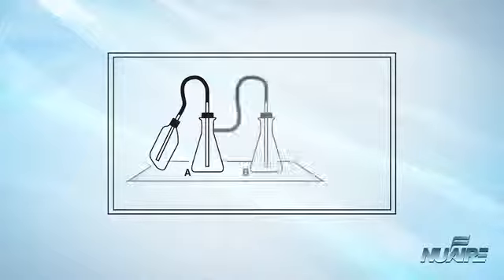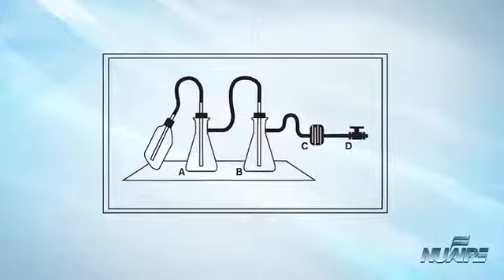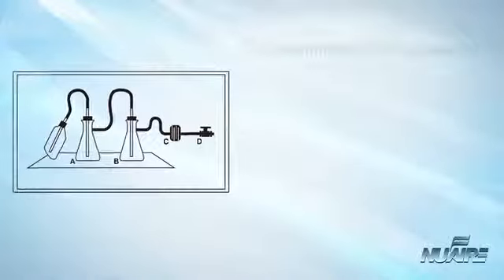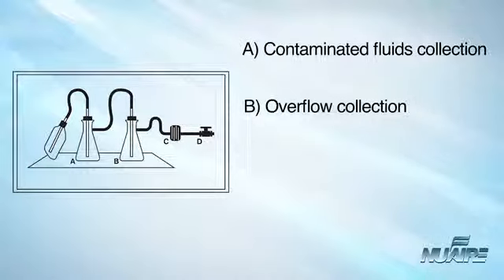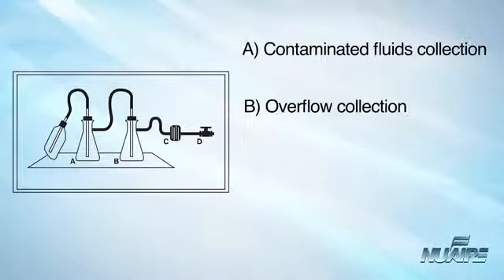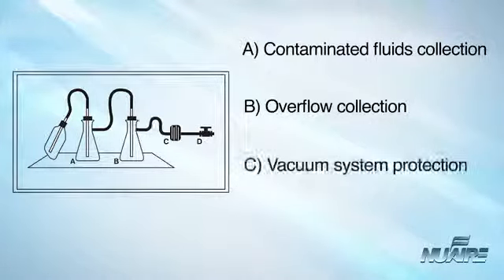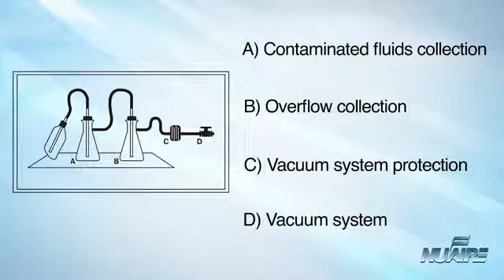Aspirator bottles or suction flasks should be connected to an overflow collection flask containing appropriate disinfectant, and to an inline HEPA or equivalent filter. The left suction flask, A, is used to collect the contaminated fluids into a suitable decontamination solution. The right flask, B, serves as a fluid overflow collection vessel. A glass sparger in flask B minimizes splatter. An inline HEPA filter, C, is used to protect the vacuum system, D, from aerosolized microorganisms or contaminated liquids.